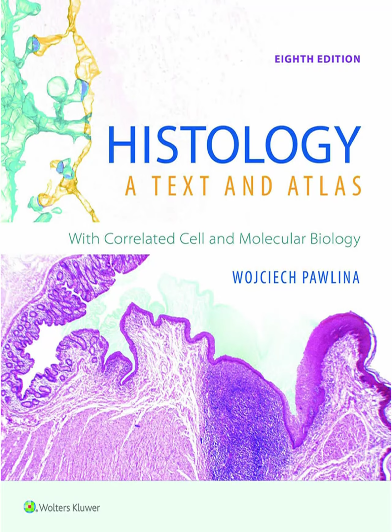That's really what histology offers, a way for scientists and doctors to peer into the microanatomy of cells, tissues, organs, and, crucially, understand how their intricate structures dictate their vital functions. So this deep dive is all about revealing the diverse, really ingenious methods histologists use, from basic staining to some seriously cutting-edge microscopy, and why these microscopic insights matter so deeply to your understanding of health and biology.